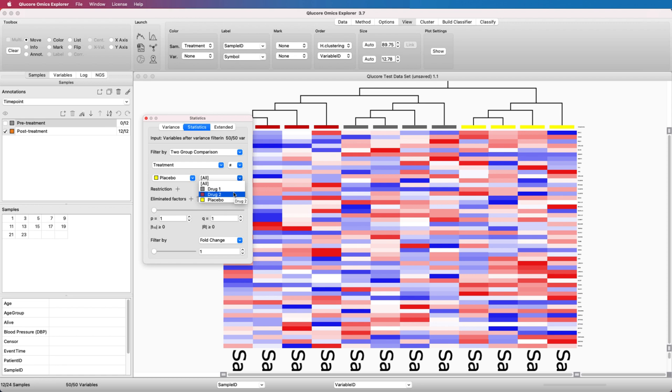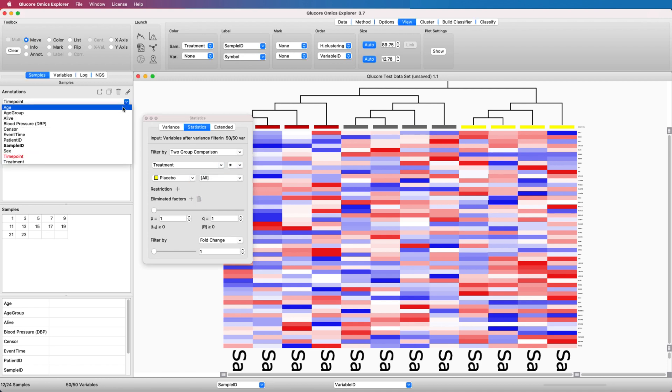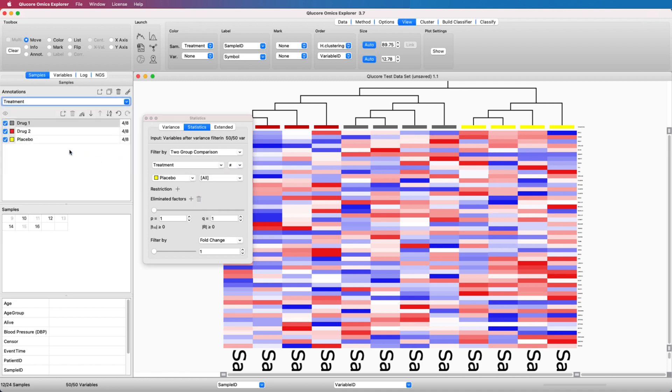Please note that if you select either Drug 1 or Drug 2 as a second value, the statistical test will be restricted to only this group. If you want to exclude a group from the analysis, we recommend that you also untick it in the Sample tab so that the plot only shows the active groups.